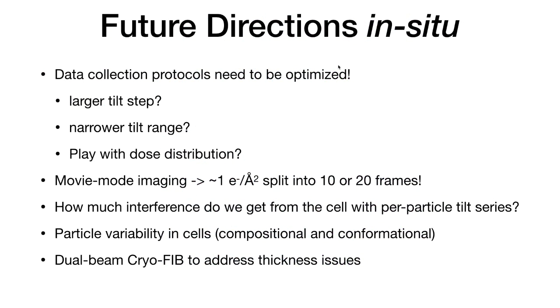For typical in vitro problems, the advantage of subtomogram averaging is simply that if you have a lot of flexibility in the protein or the molecule, if each particle is in a slightly different conformation, having some three-dimensional information about each particle can be very valuable in trying to subclassify them, group them together, and figure out what the 3D dynamics looks like. If your target is to get high-resolution structures from purified molecules, single particle reconstruction is obviously still your best bet.